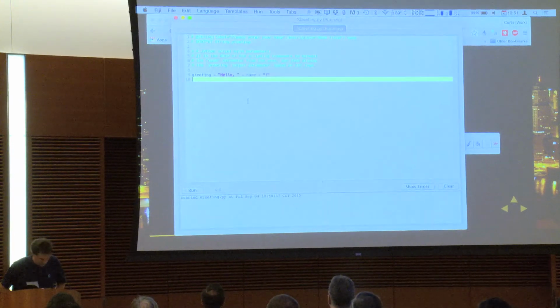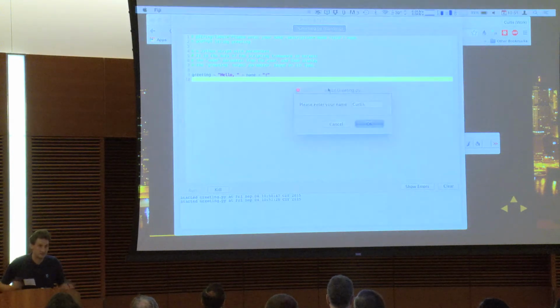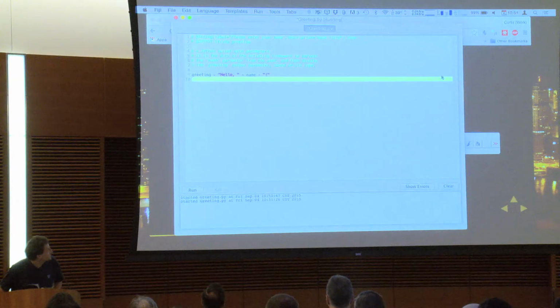So as you can see, if you run it again, you saw my name was already in there. That's because it remembers what you typed before. So by default, all your scripts will persist the values that you specify from the time before. And there's a way to suppress that if you don't want that behavior, and I'll show you how to do that. So that's the most basic example.